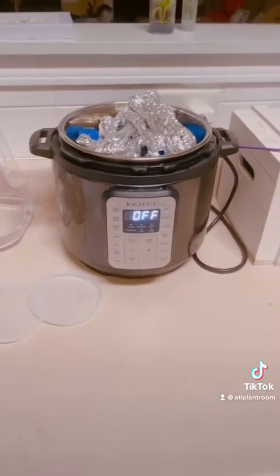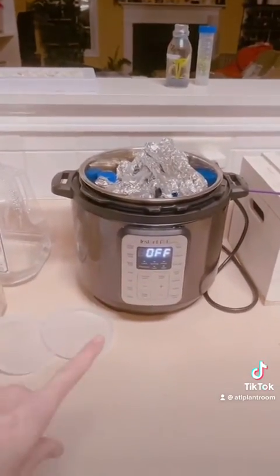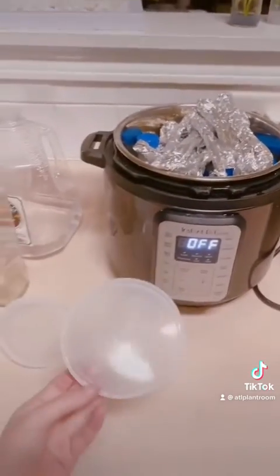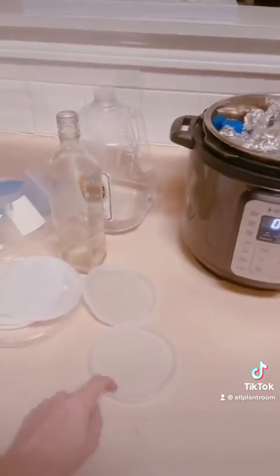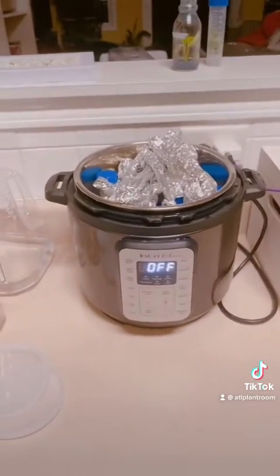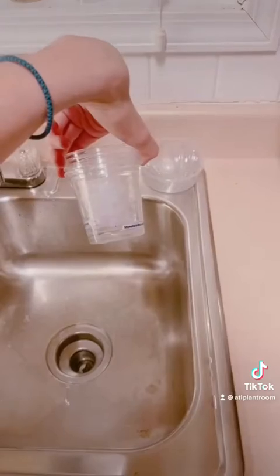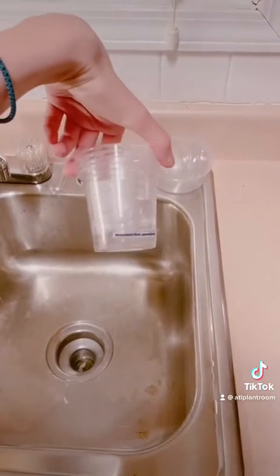I want to warn you guys — make sure you are not putting anything in here that should not go in here. There's only one type of plastic that can be autoclaved. These lids are not it, which is why they're bent. I just melted some of these flasks; I thought they were able to be in the autoclave but apparently not.